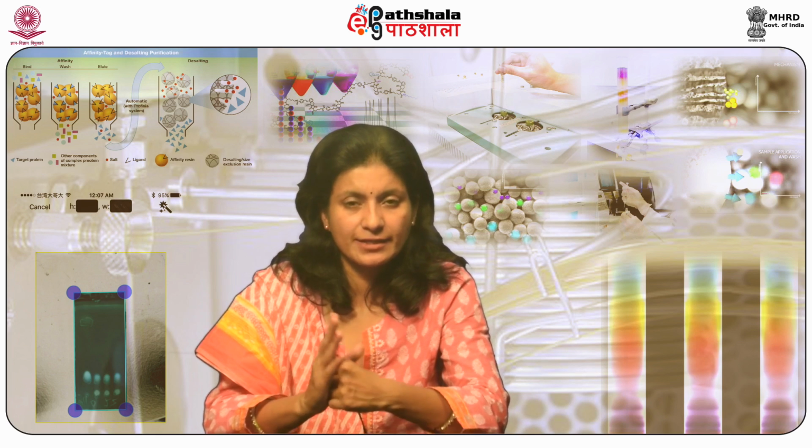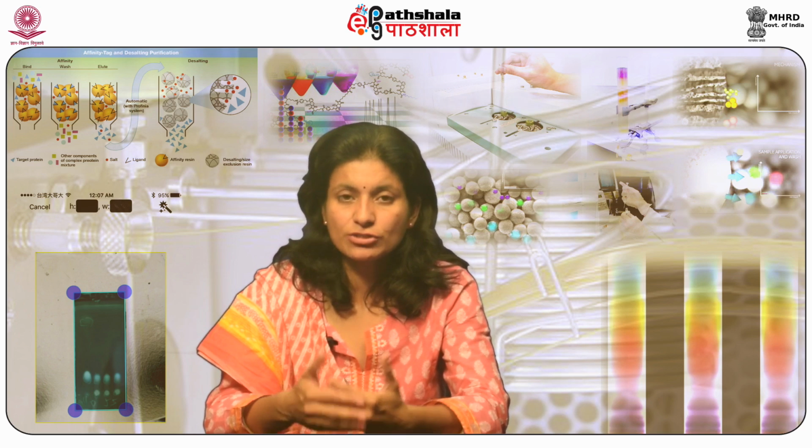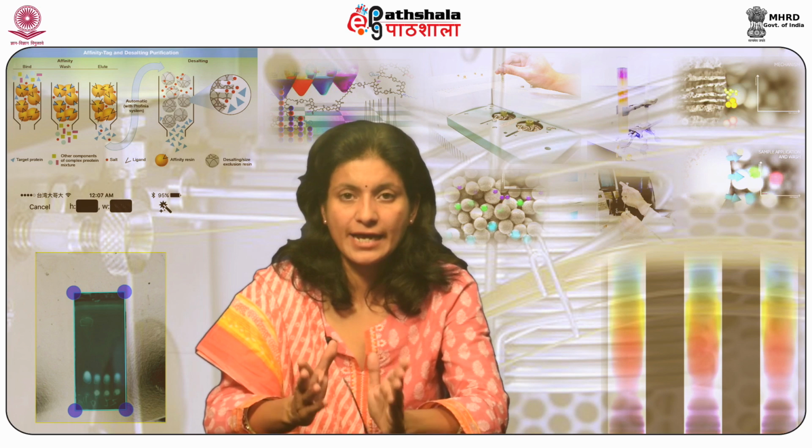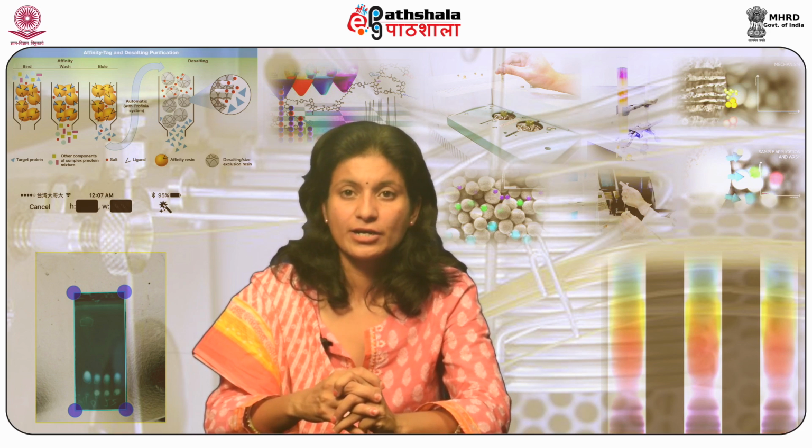Significant examples. One of the significant examples of this technique is the evaluation of total cyanide by IEC. Cyanide is complexed with metals such as iron, and substantial digestion with acid in the presence of magnesium chloride catalyst is required to liberate cyanide.